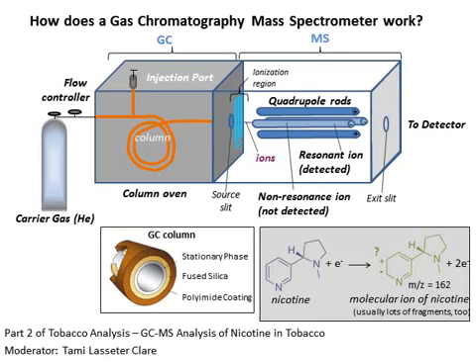And then inside the oven, the temperature will ramp from a low temp of about 60 to a high temperature of about 250 C, and that will allow higher and higher molecular mass molecules to volatilize and then move through the column. Helium is used as a carrier gas, which you may not actually see because the tank is always connected to the GC and always flowing. You won't see the other end of the column as it is connected to the mass spectrometer.